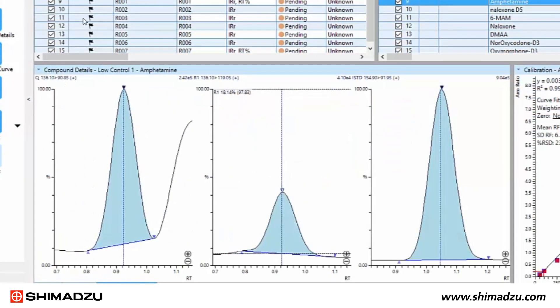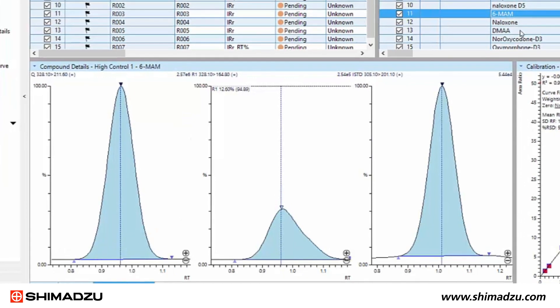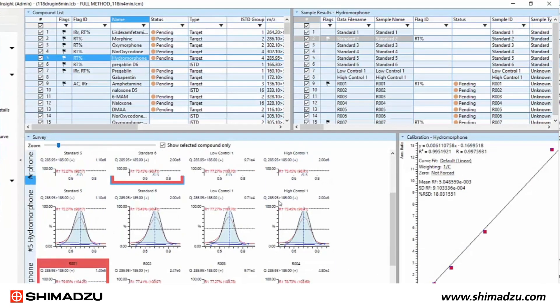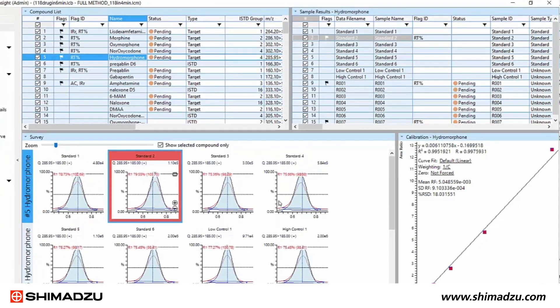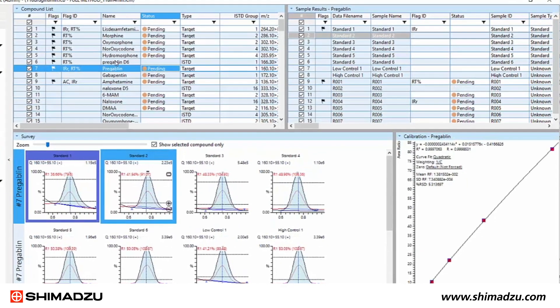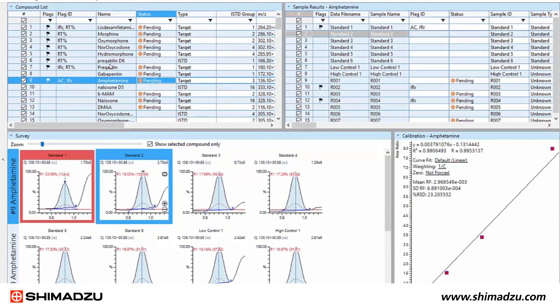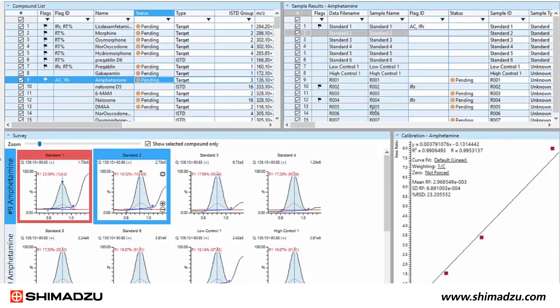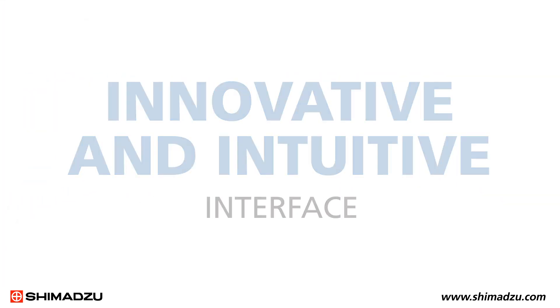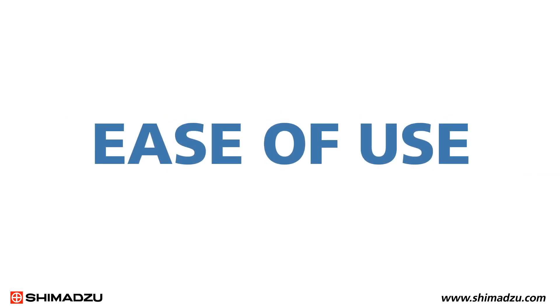You can also compare all peaks against a reference peak or reference ions with a single click. Lab Solutions Insight displays peak information in an easy-to-understand format and accommodates multiple user working environments. An innovative and intuitive interface ensures fast ramp-up times and ease of use.